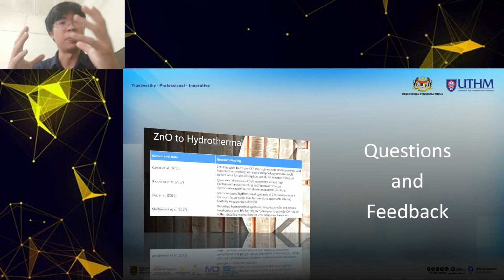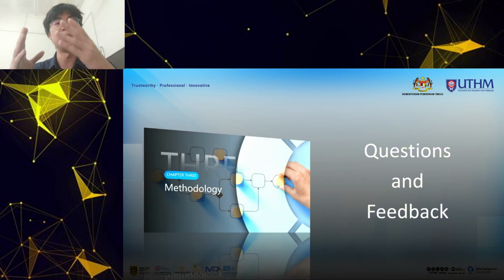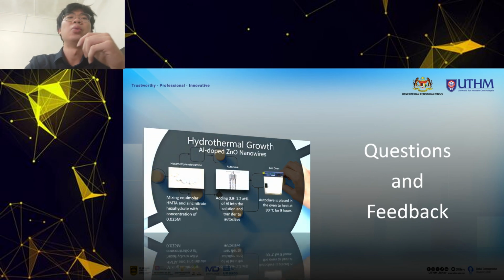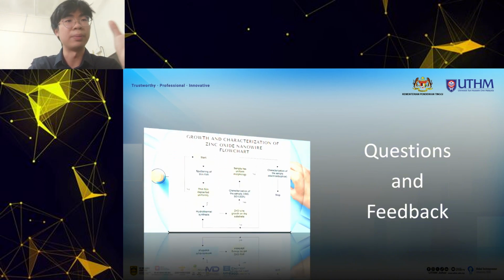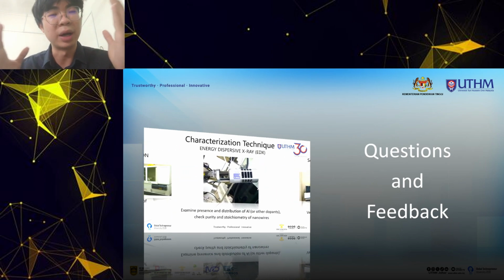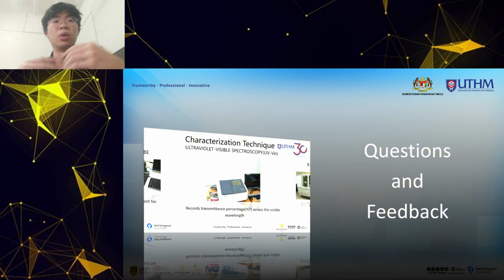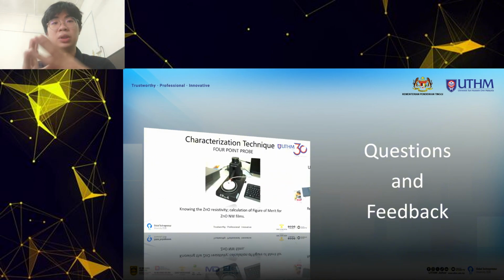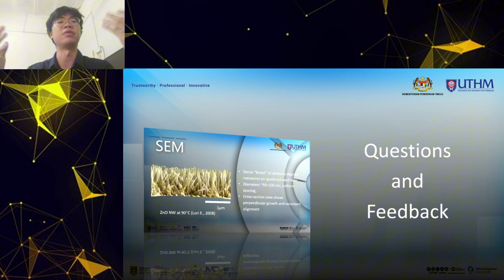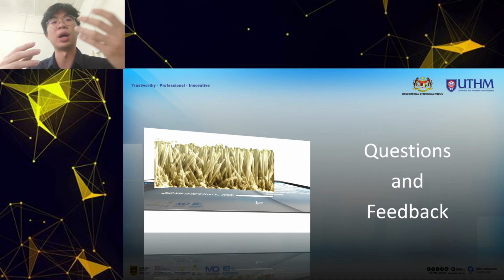So I will correlate the doping levels with structural XRD, compositional EDX, optical UV-vis, and electrical 4-point probe properties. And I will identify the optimum aluminium concentration, which is predicted around 1.0 to 1.1%, that maximizes the transparency-conductivity trade-off as quantified by a peak figure of merit. So achieving these goals will demonstrate the feasibility of a low cost and abundant aluminium doped zinc oxide nanowire, and the insight gained will lay a solid foundation for future device fabrication and performance testing, ultimately contributing to more sustainable and scalable solar technology.